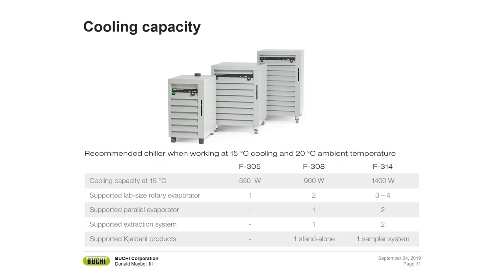You're distilling too fast for the system to handle. So it's very important that throughout your process, or even before you buy a unit, make sure you have adequate cooling capacity so that you can get the highest throughput and not hurt your throughput by not having a large enough cooling capacity.